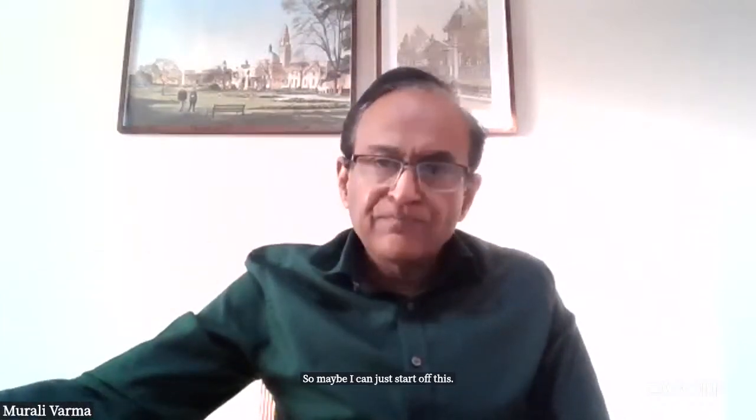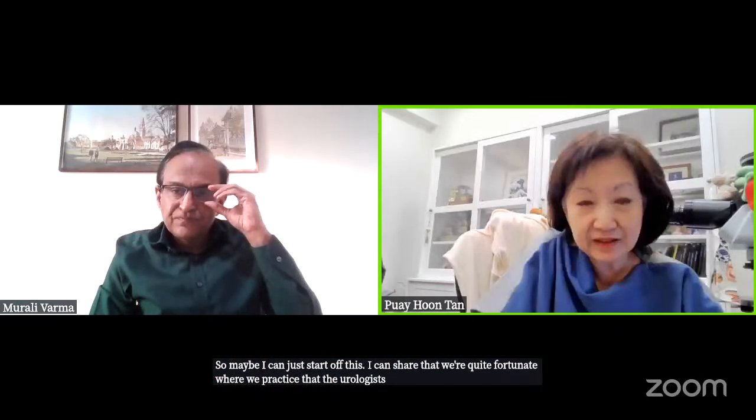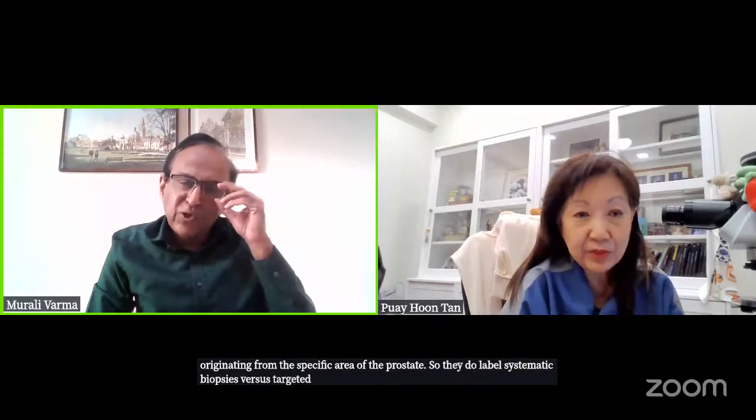So maybe I can just start off first. I can share that we're quite fortunate where we practice that the urologists and the radiologists who perform the biopsies actually label all the biopsies carefully and in different bottles, and therefore the laboratory just follows the labeling that has been given, and we report based on the individual cores that are specifically identified as originating from the specific area of the prostate. So they do label systematic biopsies versus targeted biopsies, and when there's a region of interest.